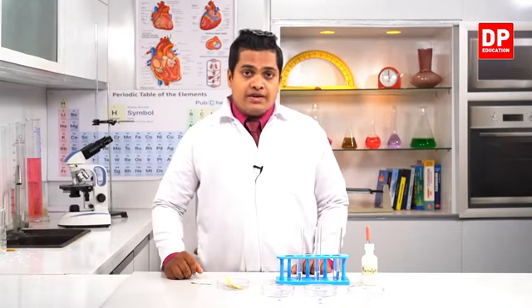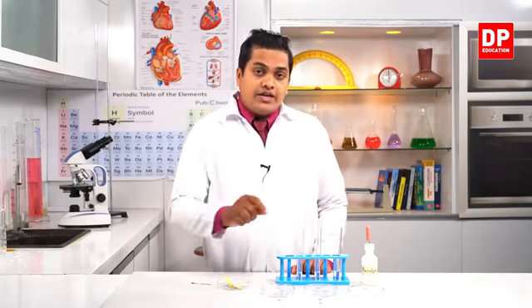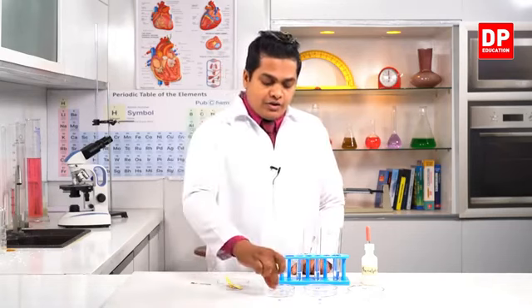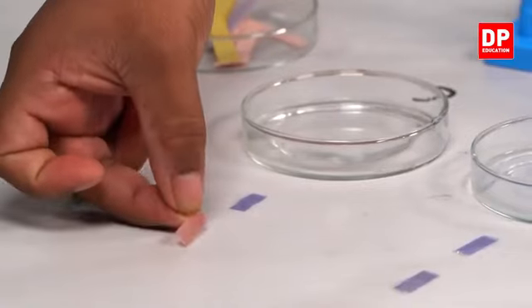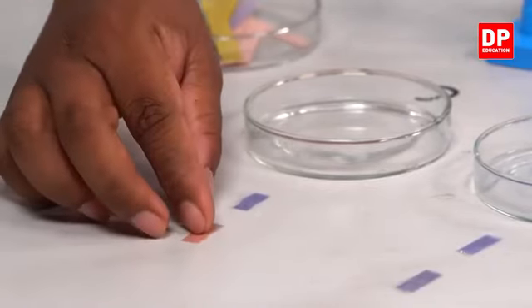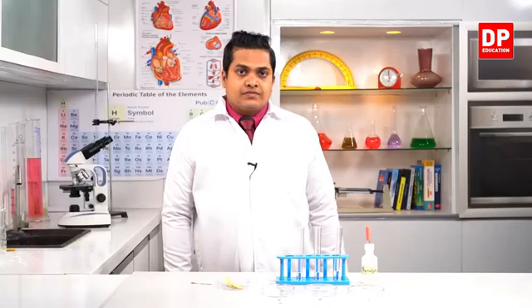That's a unique feature of bases, and we can use this activity to identify bases in our day-to-day life by using these litmus papers. So when you add red litmus to a base, red will turn to blue color, like in the case in here. Okay. Now the neutral substance, which is salt. So there is no difference in the color. The red is going to stay the same red color, right?